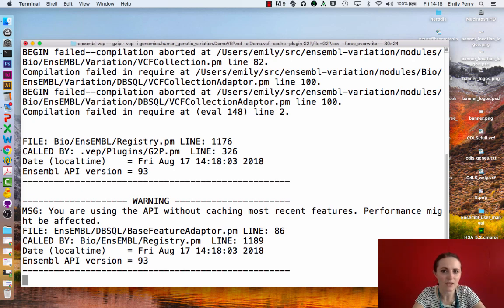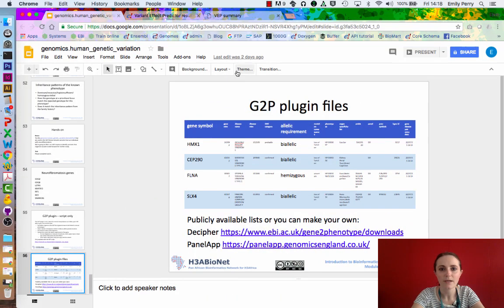It's doing lots of thinking at the moment and producing data for me, but very shortly it will tell me that it's done because it is quite a small VCF file. Okay, so that's it done. It's ready for me to show another one. Now I've actually pre-done this and put the file up for you.